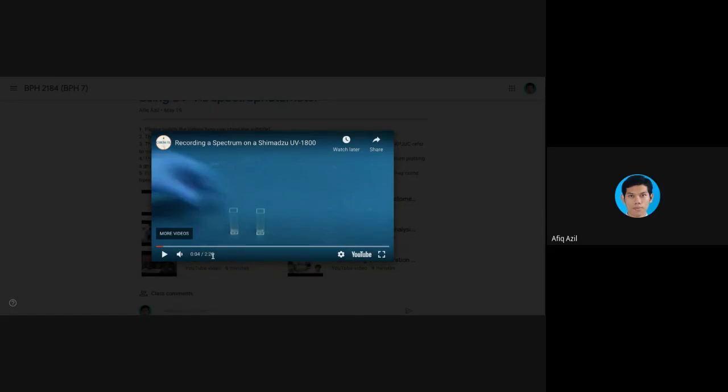But the most common shape of cuvette is this square cylinder. Well, it's not a cylinder, it's round, but this is a square shape in which there are four sides. Two of those sides are transparent, and the other two sides are translucent or sort of opaque. The transparent sides are where the light will go in and also go out. I think the cuvette in these videos is made out of quartz crystal.